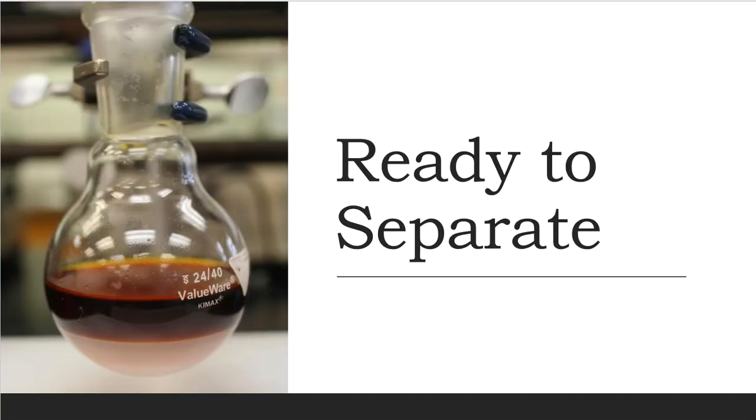All right, so next, brand new day. Brand new day, July the 1st. Brand new day, but not a brand new lab. It's the same old lab from what I did the day before. So I am now ready to separate. And this is what my ending product begins to look like. So once more, make some observations, folks. This is getting ready to go into a separatory funnel. And we can describe what this solution looks like at this moment.